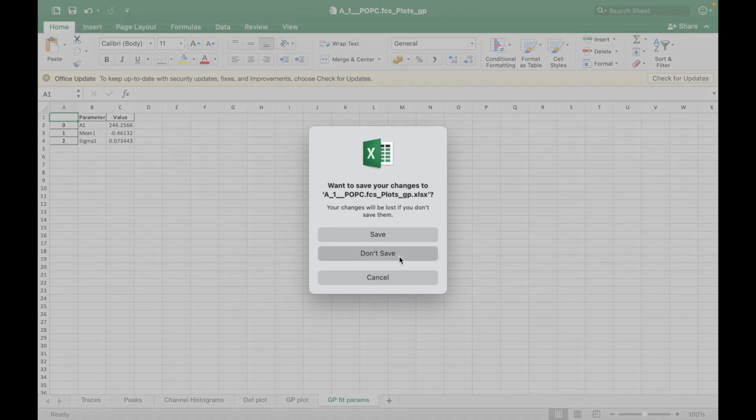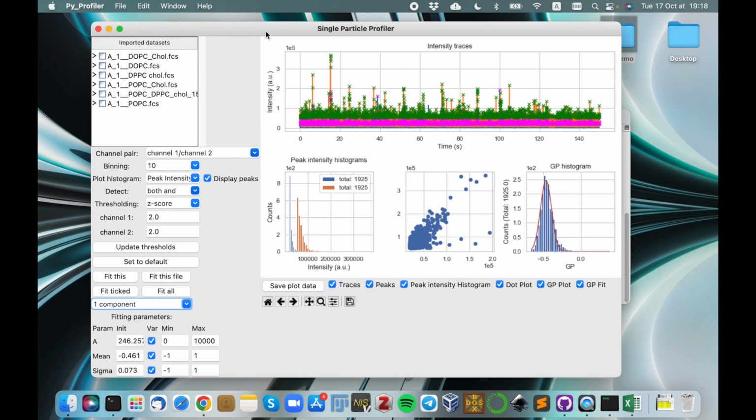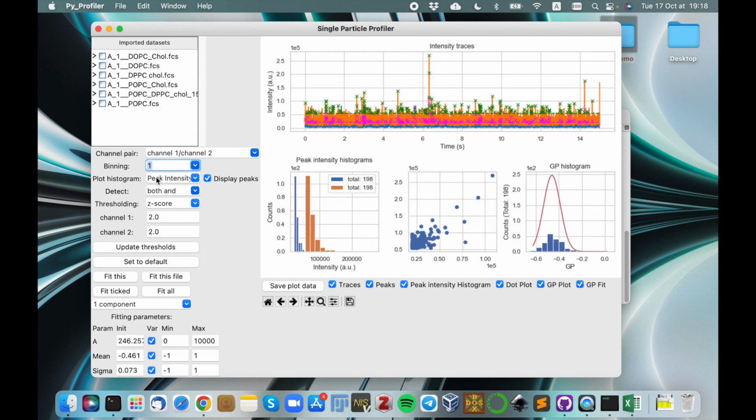Now in principle we can close this, and we can go back here, and now I will go back to just repetition 1, and then what I want is the bulk analysis. So pretty much I want to analyze all of them except this one, because this one is a bit unique, so we will talk about this one a little bit later.